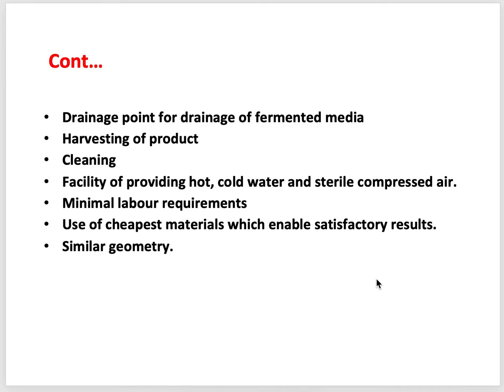similar geometry. These two points, minimal labor requirements and use of cheapest material which enables satisfactory results, are actually important, because if your fermentation process requires lots of labor, the cost will increase, which will not be good for the industry. And also, if you can use cheaper raw materials, the cost will also again be lower. And similar geometry.